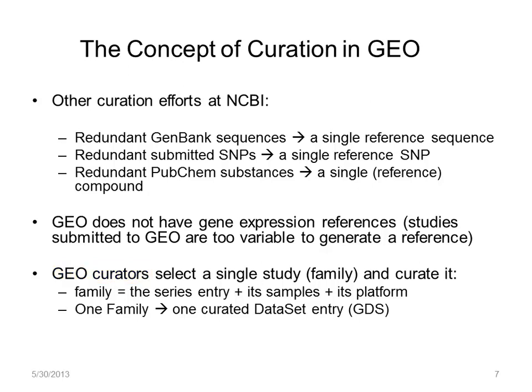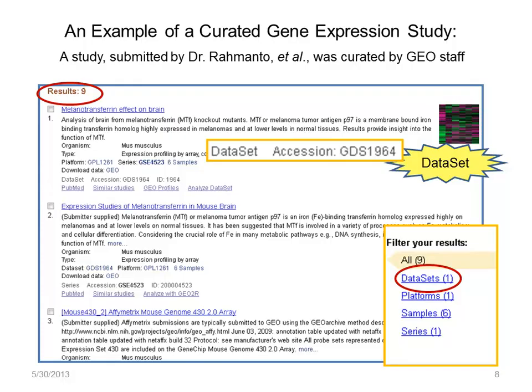This allows easier comparison of gene expression profiles in the whole study. Let's look at an example of a curated dataset. Here we have a web display of records from a curated study. Originally, Dr. R submitted eight records — six samples, one platform, and one series. And this family of records was curated into a dataset record, GDS-1964.